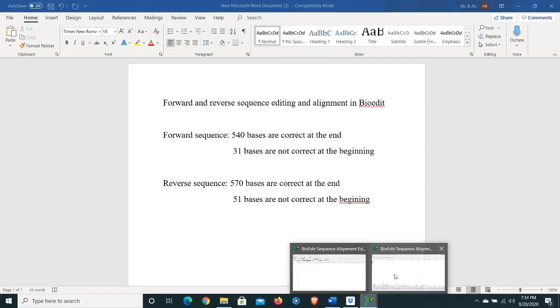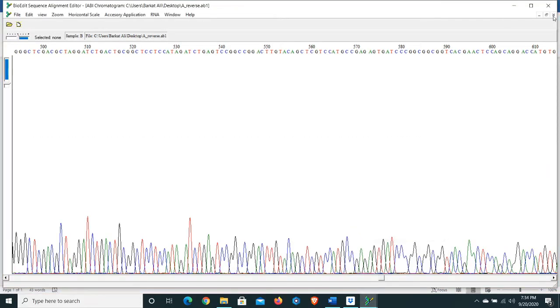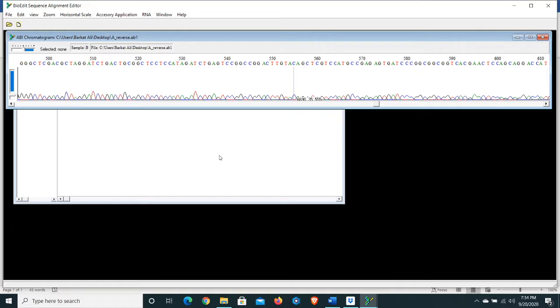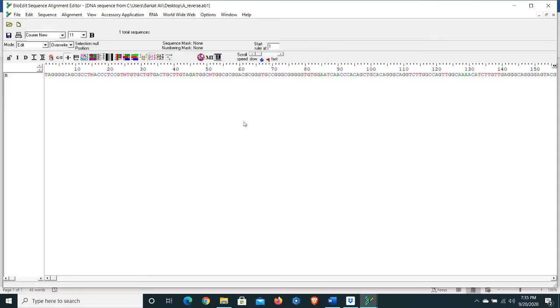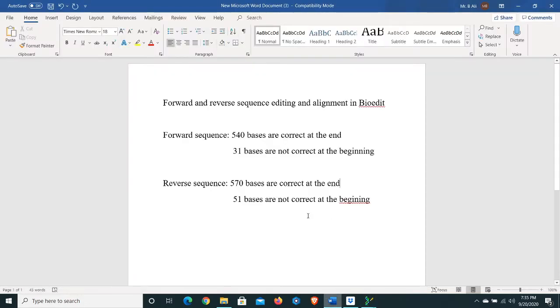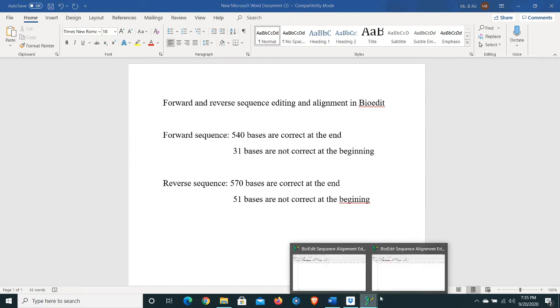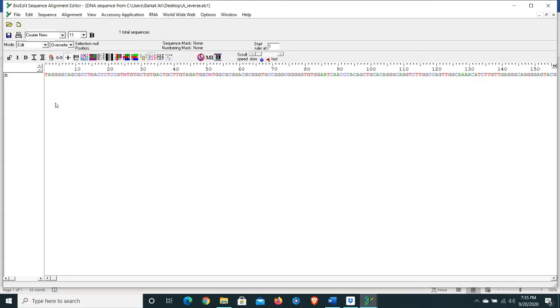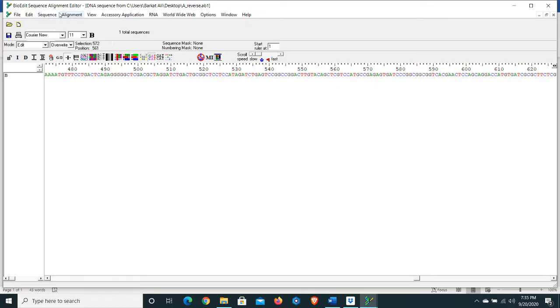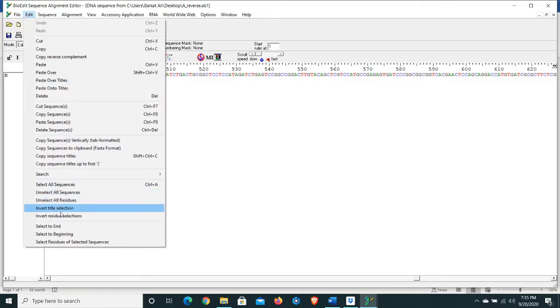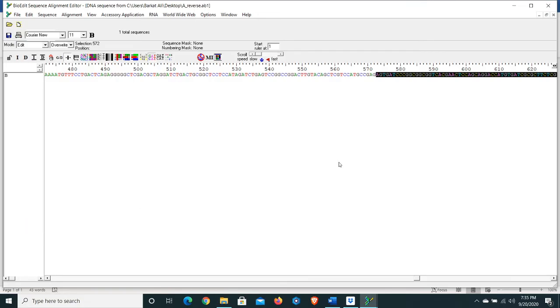Go back to the reverse sequence, zoom in, and open the second file. Go to Mode and select Edit option, then zoom out. Look again at your recorded data — 570 bases are correct at the end. Let's make changes in this file. Mark position 570.